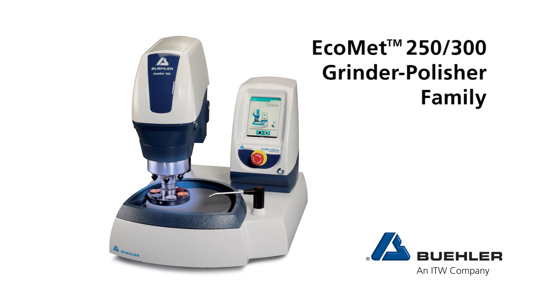The EcoMet 250/300 grinder polisher family.